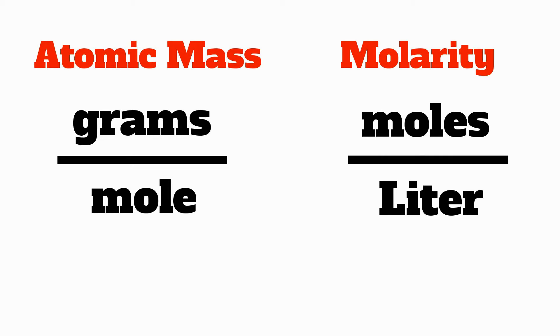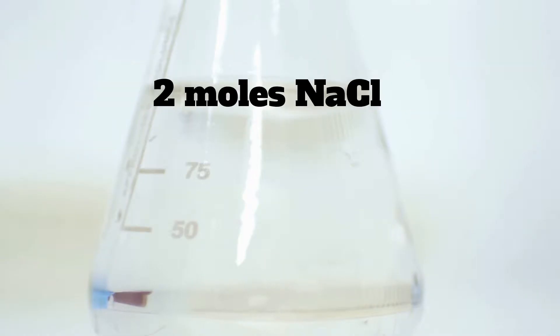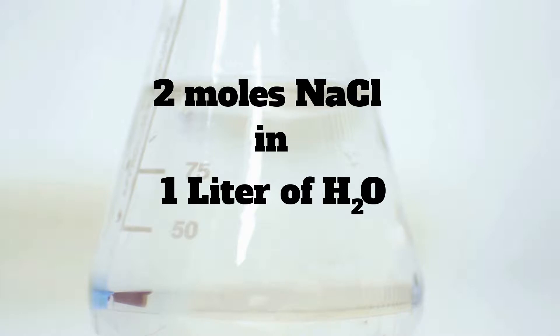So let's say you came across a protocol that required you to make a 2 molar solution of sodium chloride. That means you want 2 moles of salt in 1 liter of water.